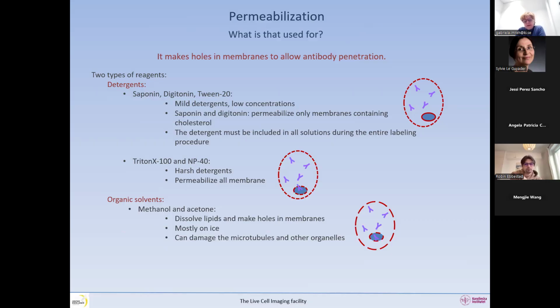on the cells. So you always have to use the permeabilization agent that is suitable for your scientific question. If you use the wrong one, it might remove your target. Also remember that methanol and acetone are also used as fixatives. So it doesn't really make sense, if you fix some samples with PFA, that you then use methanol as a permeabilization agent, if it's not particularly specified in your protocol for some reason.